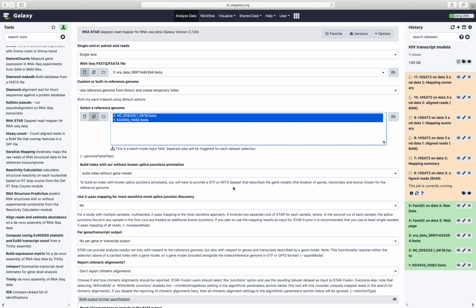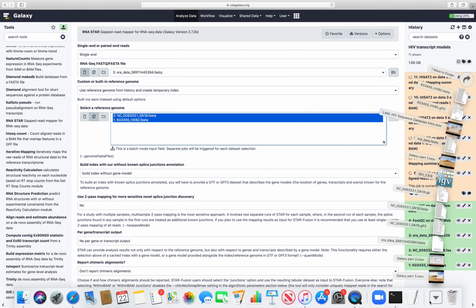I think I may save this as another, because we have a call right now. And I want to work on this a little bit more before sharing this with y'all. So I will do some exploring with this tool, because we have our GFF3 models. We have something that can serve like a transcript model, but it's not exactly the same thing, so I'll spend some time explaining why.